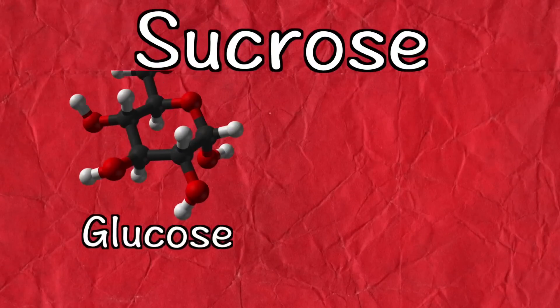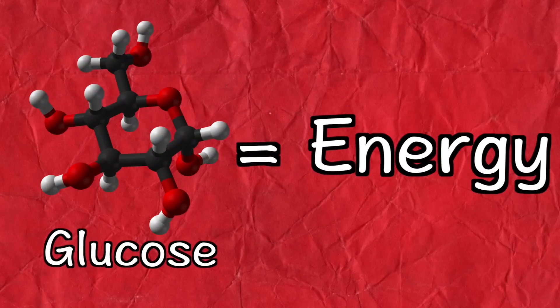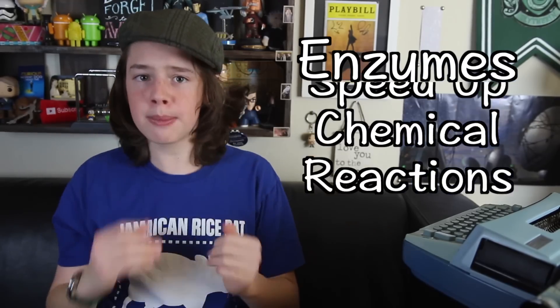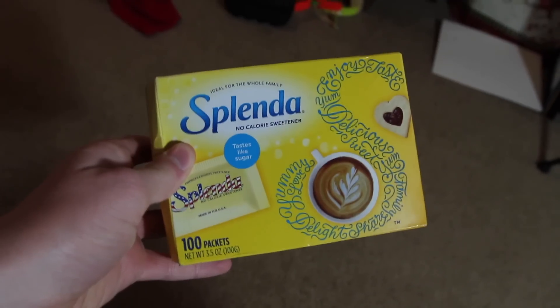How do we do that? Well, when we eat and digest sugar, or sucrose, our body turns it into glucose and fructose. Fructose is delivered to your liver and promptly turned into glucose, and glucose is the stuff your body uses as energy. To find out if there's any calories in this packet of Splenda, we have to find out if there's any glucose in it. We'll do two experiments. For the first experiment, the control test, we'll dissolve 0.2 grams of sugar and 0.1 grams of an enzyme called invertase in water. Enzymes are things that speed up chemical reactions, or catalysts. Thus, the enzyme will quickly break down sugar into glucose and fructose. In the second experiment, we'll use the exact same procedure but change one material — instead of using sugar, we'll use Splenda. Let's go to the lab!